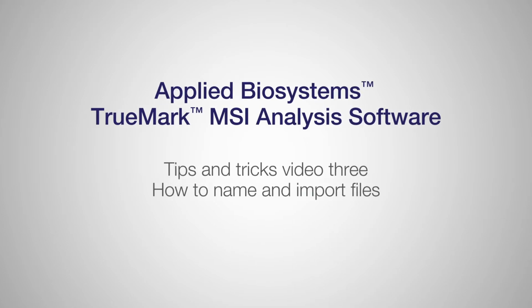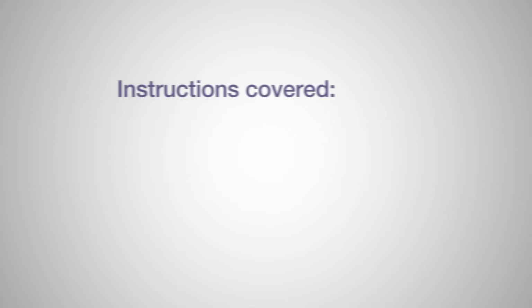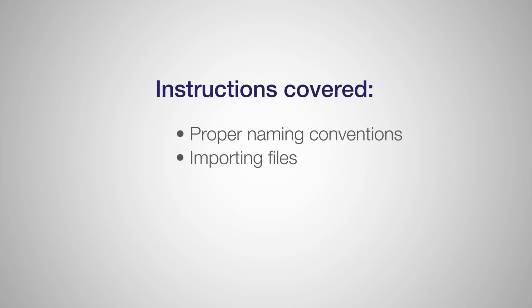Welcome to the third in our series of tips and tricks videos for the Applied Biosystems TrueMark MSI Analysis Software. In this short video, I'll cover proper naming convention for data files and how to import them.